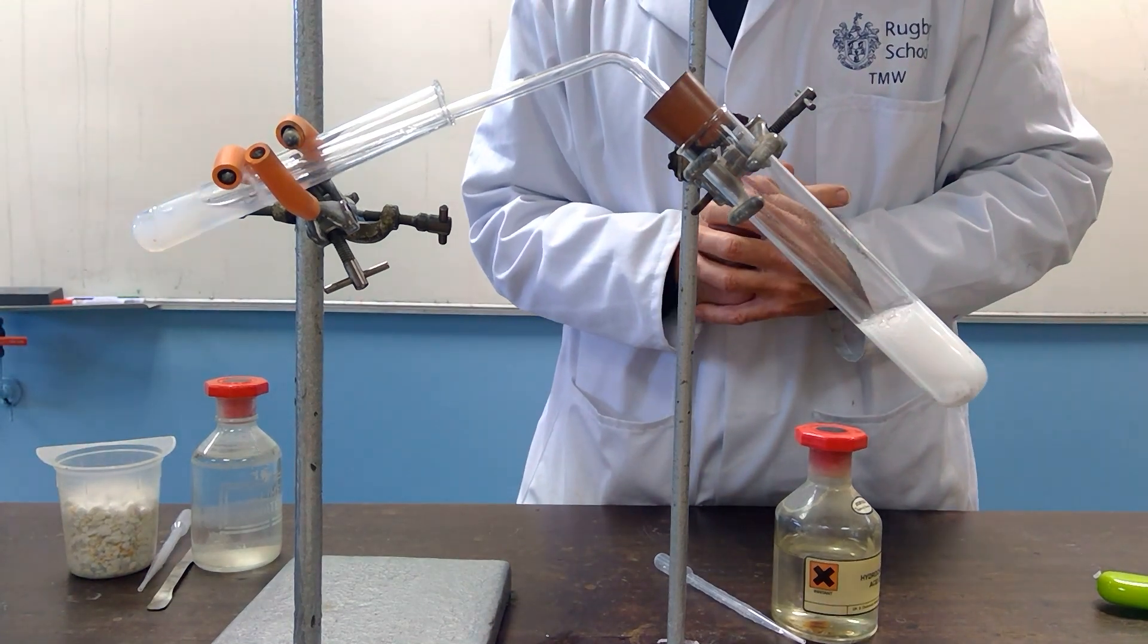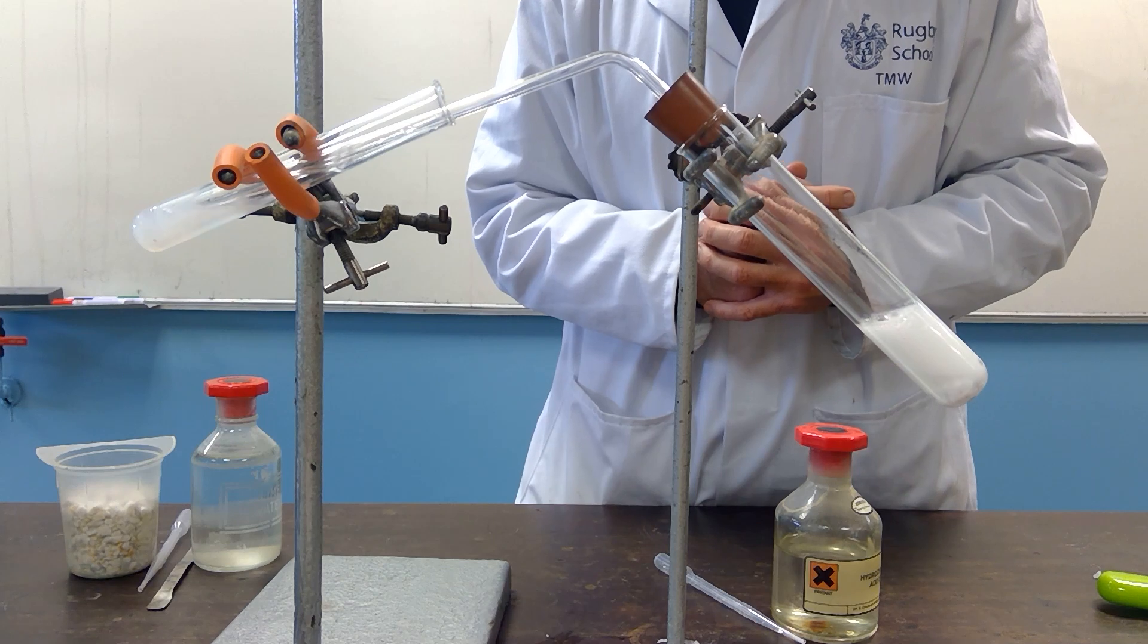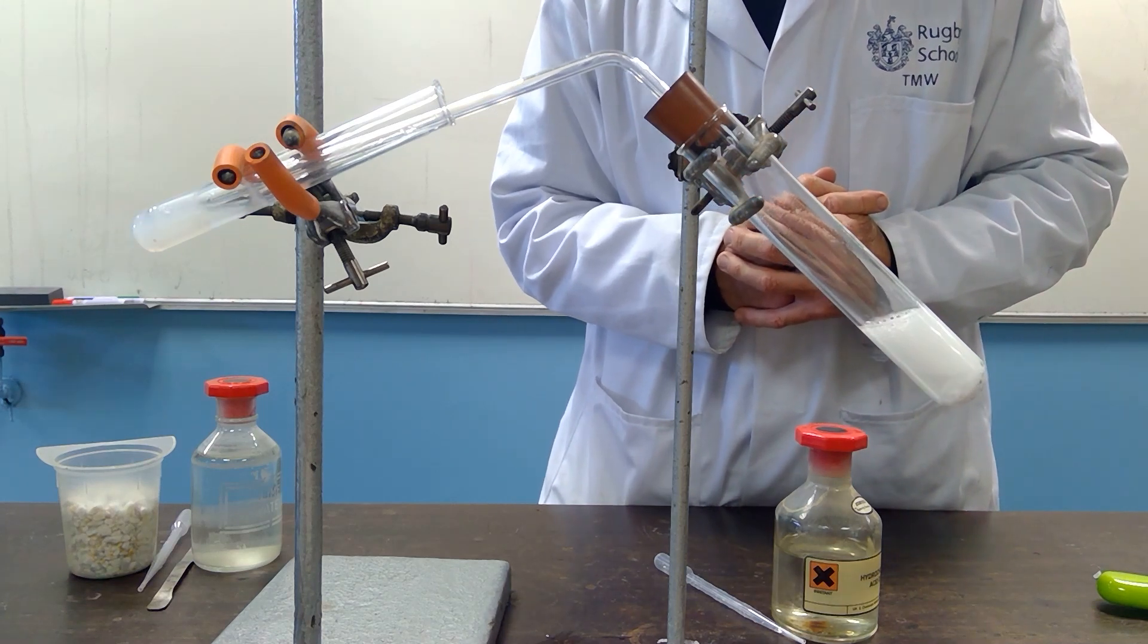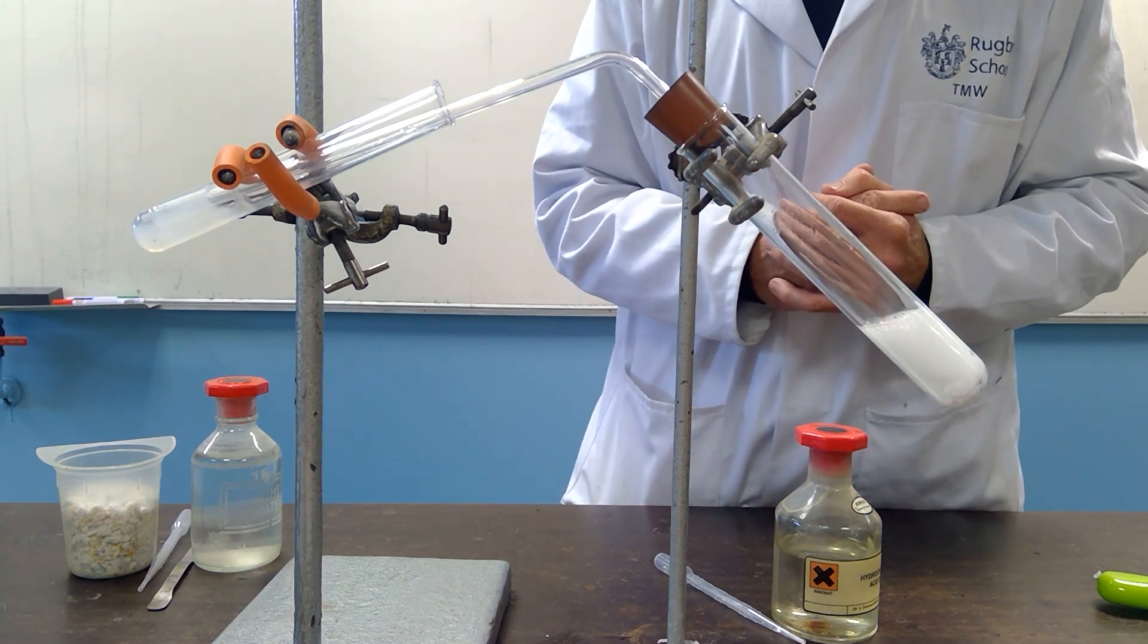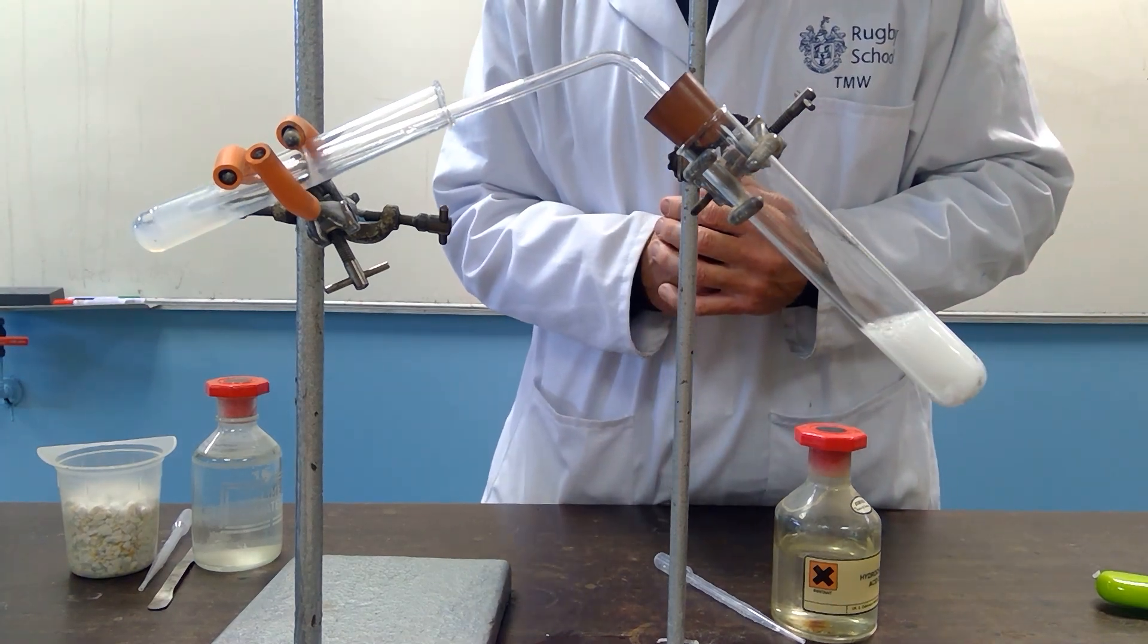We let this one run for a little while. If you continue to bubble the carbon dioxide through the lime water, ultimately it will clear again. And as you can see, there is a very healthy production of the carbon dioxide gas.